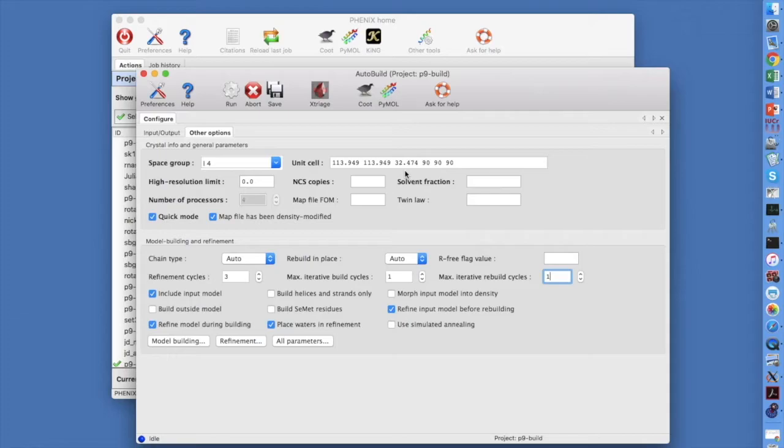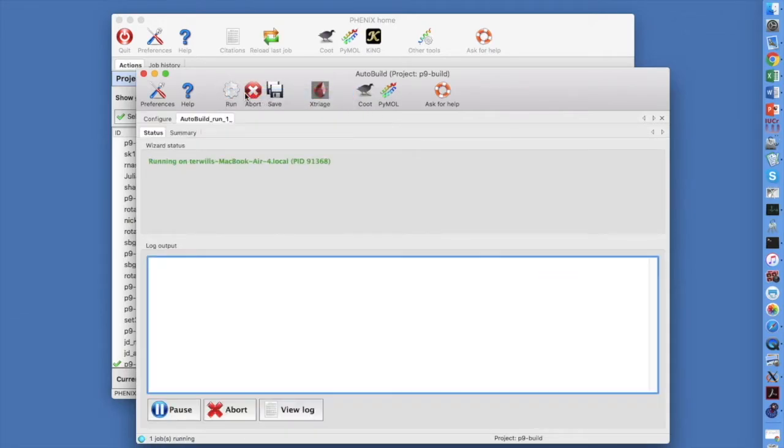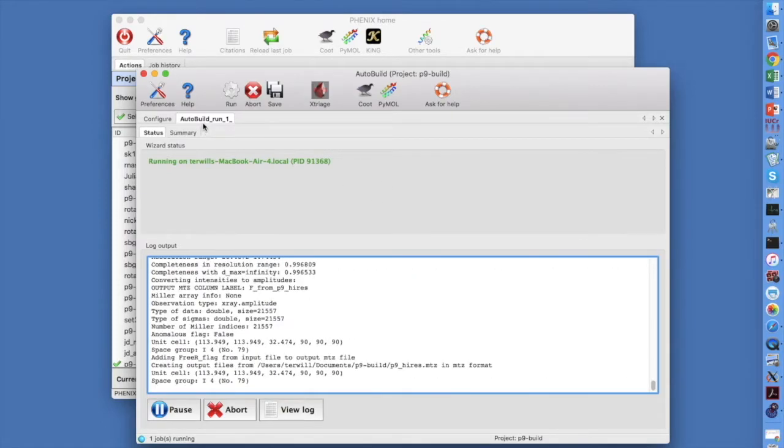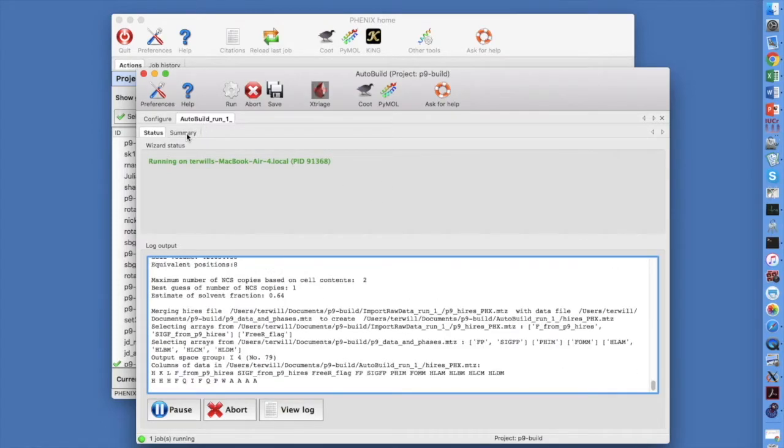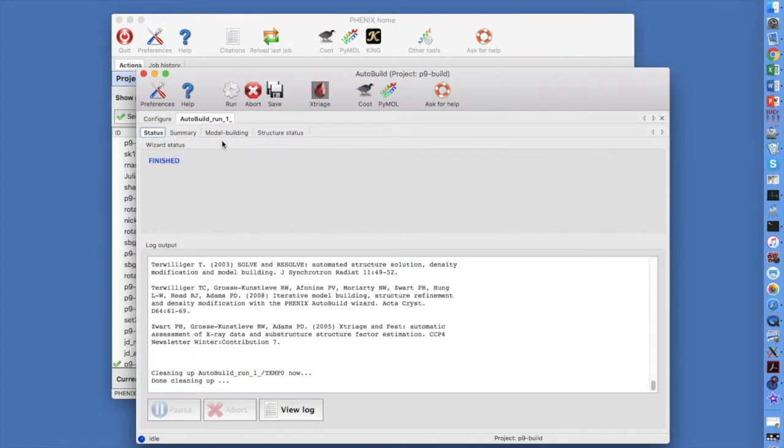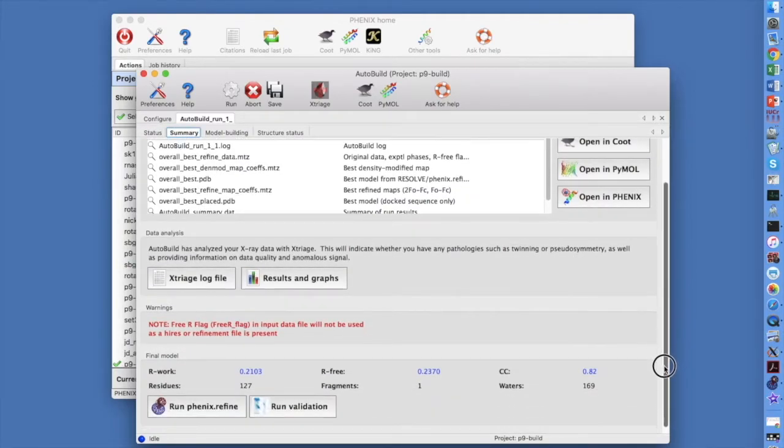We're ready to go. Click on Run and then Run Now to start the run. Once you hit Run, a new Auto Build Run tab appears and additional subtabs will appear as the run proceeds.